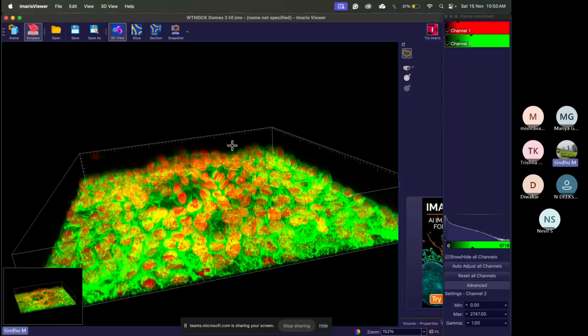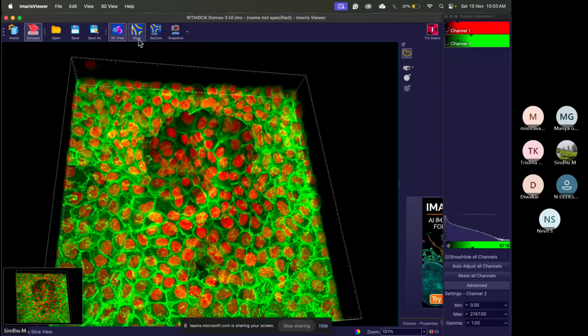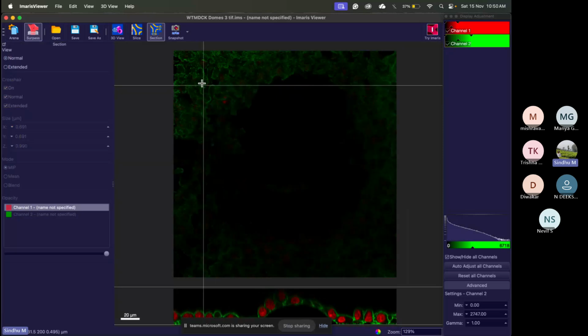If you have any tissue sections that can form different 3D shapes, then this kind of 3D viewer software is helpful. And again, this is just to see how the Z values are changing at a specific point.